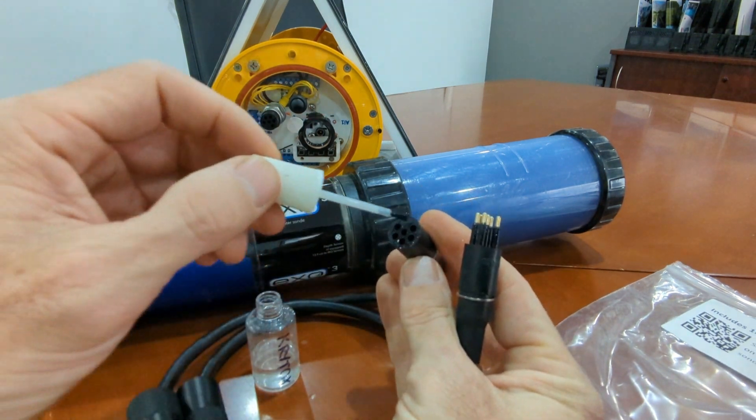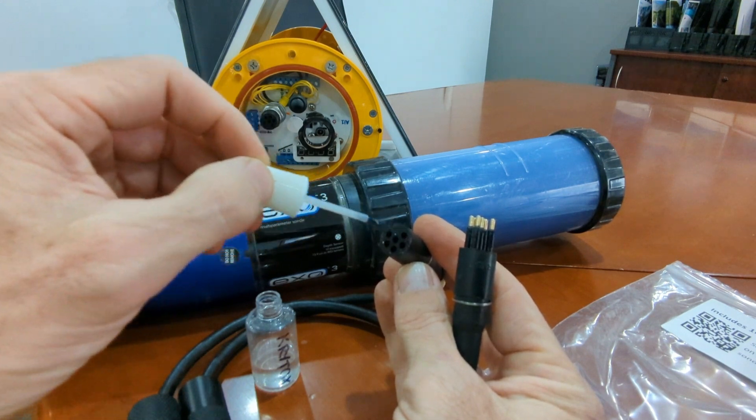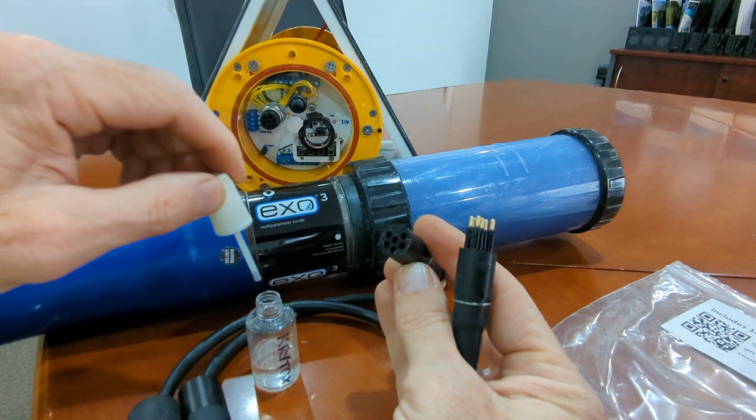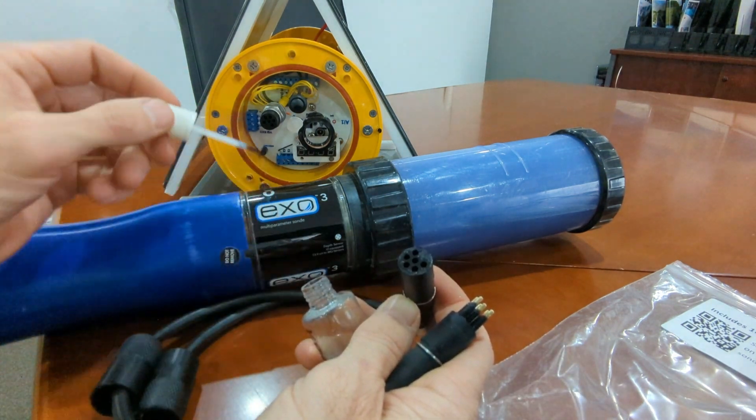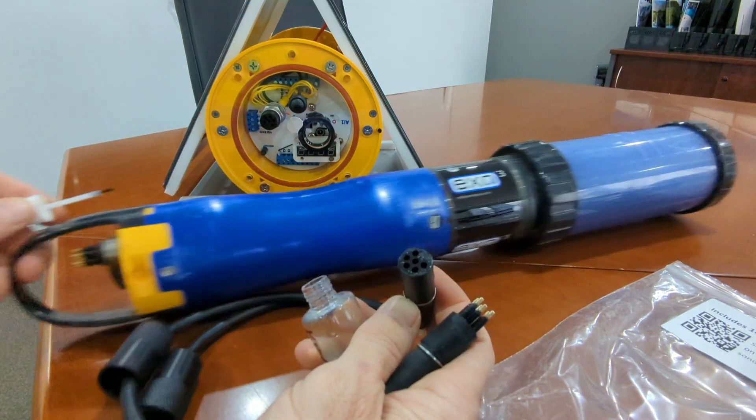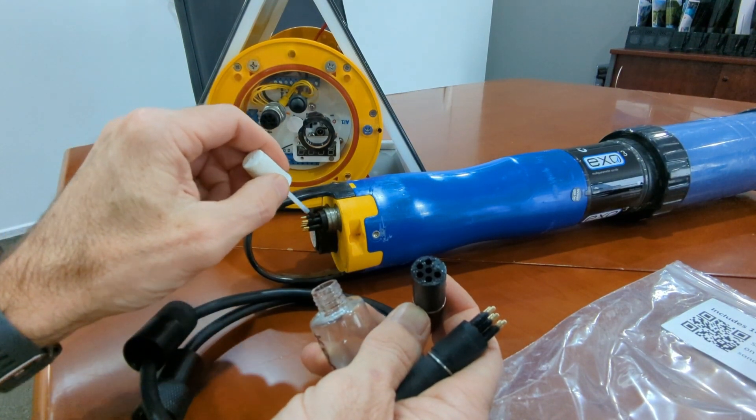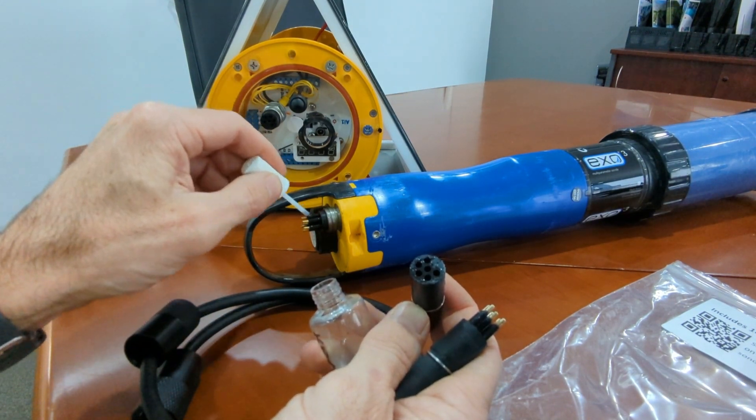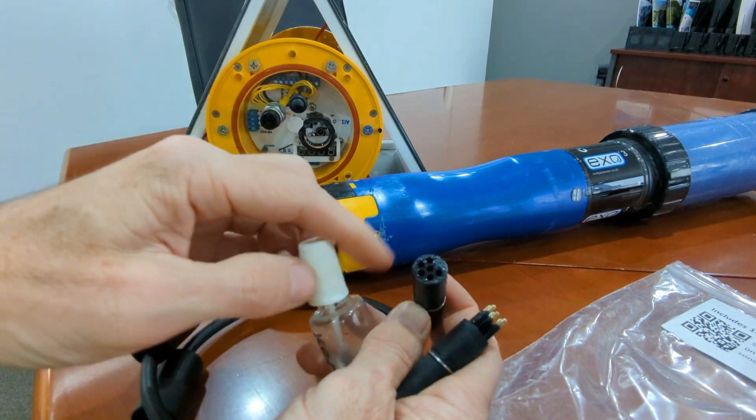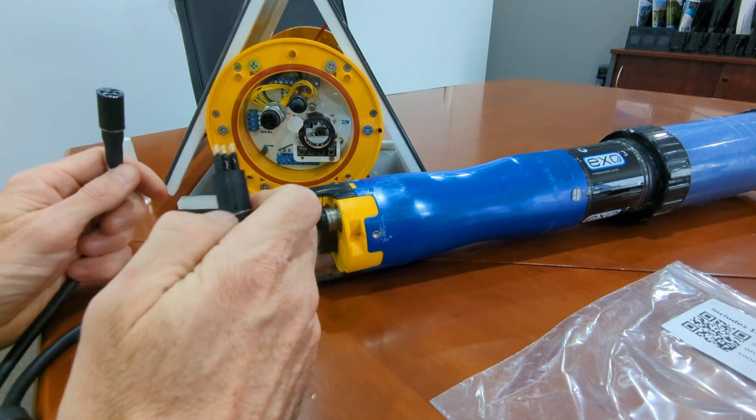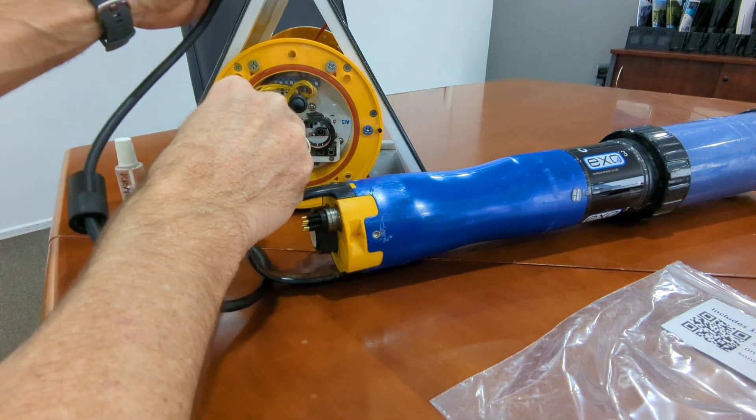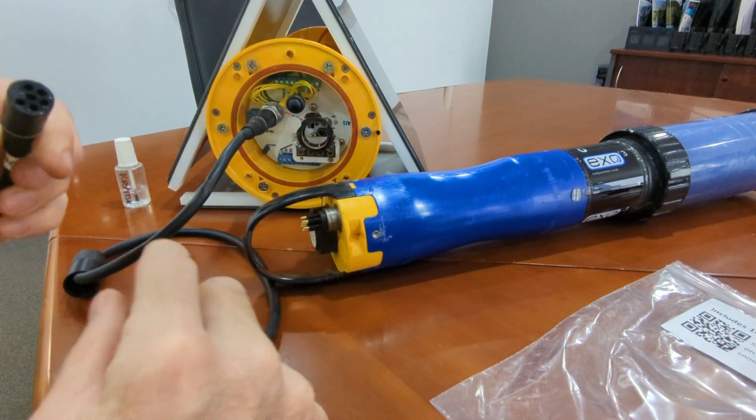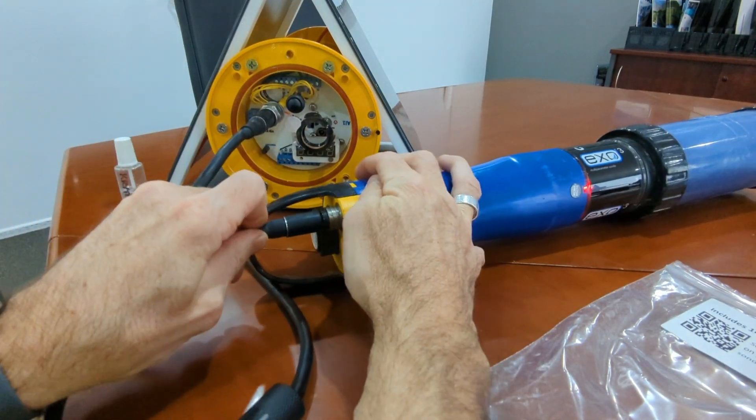Then you also lubricate the face of the female connector so that's fully lubricated. You repeat on the bulkhead connector and repeat on the male part on the sonde itself. Once lubricated, you fit the male end into the bulkhead connector on the AI-1 and put the female end on the connector onto the sonde.